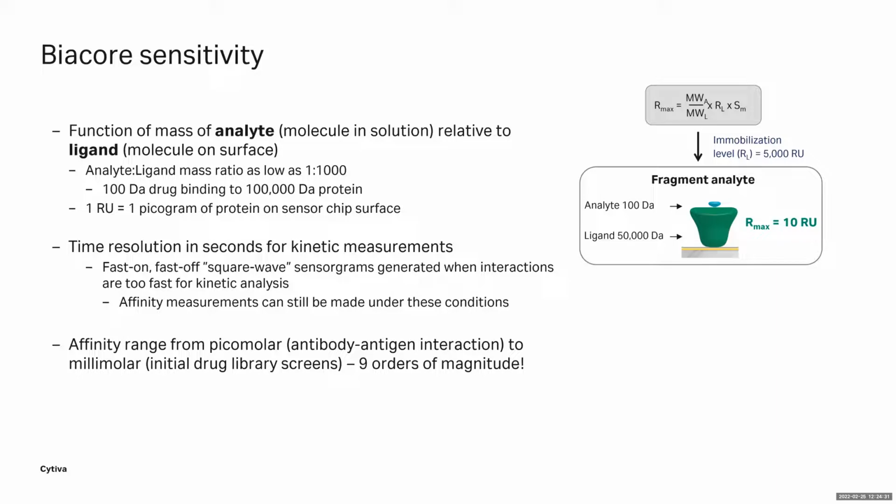Any other condition less than Rmax is essentially a measure of occupancy. And if you take that R value and compare it to the Rmax, you will get at any given point in time effectively percent occupancy. And our fitting software, in pulling out k_on and k_off, is actually solving for k_on, k_off, and Rmax in a nonlinear regression. So that's how we are getting those parameters, and hopefully that will be a sufficient explanation. We do go into it in a bit more detail in our kinetics classes that we teach on a regular basis.